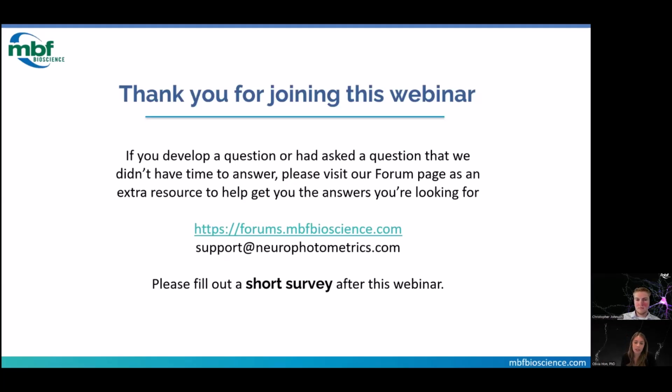Yeah, that's a really good question, and something that I think is kind of ignored a little bit in the opto field. We don't have something built currently, but there is, actually, that's not true. We have a workflow where you can dynamically modulate the laser parameters. So what you could do is a test experiment where you stimulate with XYZ parameters, then you wait a minute, and then you stimulate with your other parameters and wait a minute. Then what you could do post hoc is see what stimulation parameters give you the desired result that you want. I think it would be difficult to do in real time, but certainly you could just scan through parameters and see which ones are giving you your desired effect.